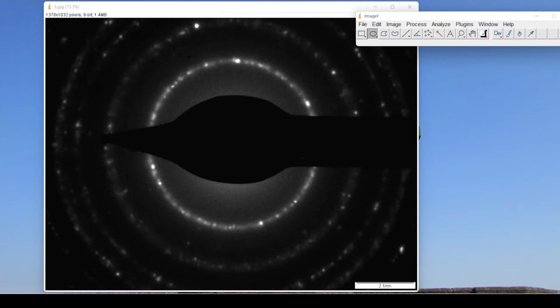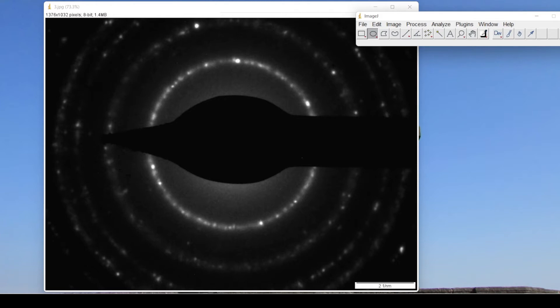Here we can see a ring pattern. This ring pattern is obtained when the sample is polycrystalline and we are going to index the planes shown in this ring pattern.